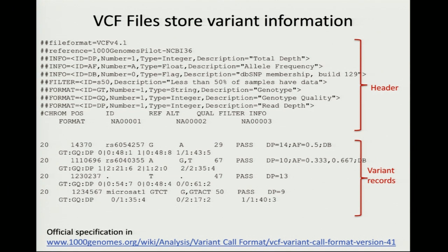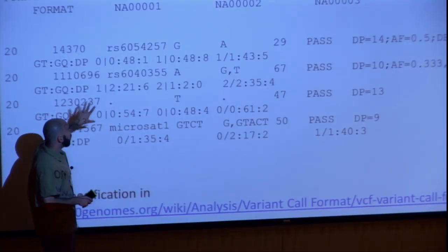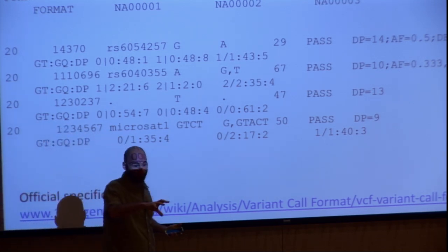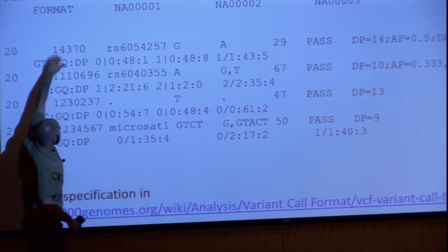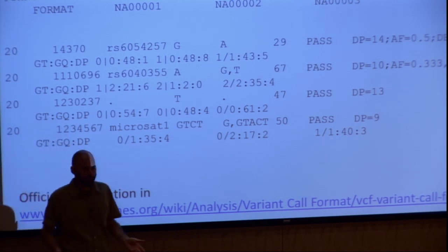They were on the same haplotype. And this 2 and this 0 go together, and they were on the same haplotype. So whoever generated this file had confidence in that phasing information, and so they were able to say which haplotype these variants were on. So it's a way to connect information from one line to another, whereas the slash just means we don't know, each variant's independent.